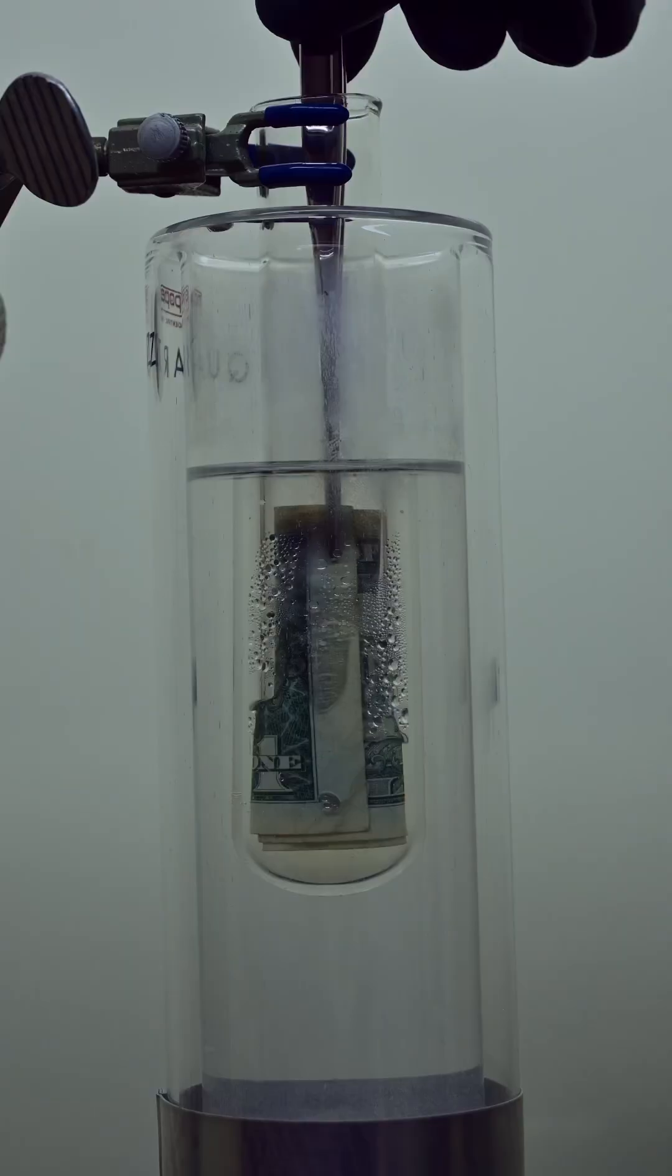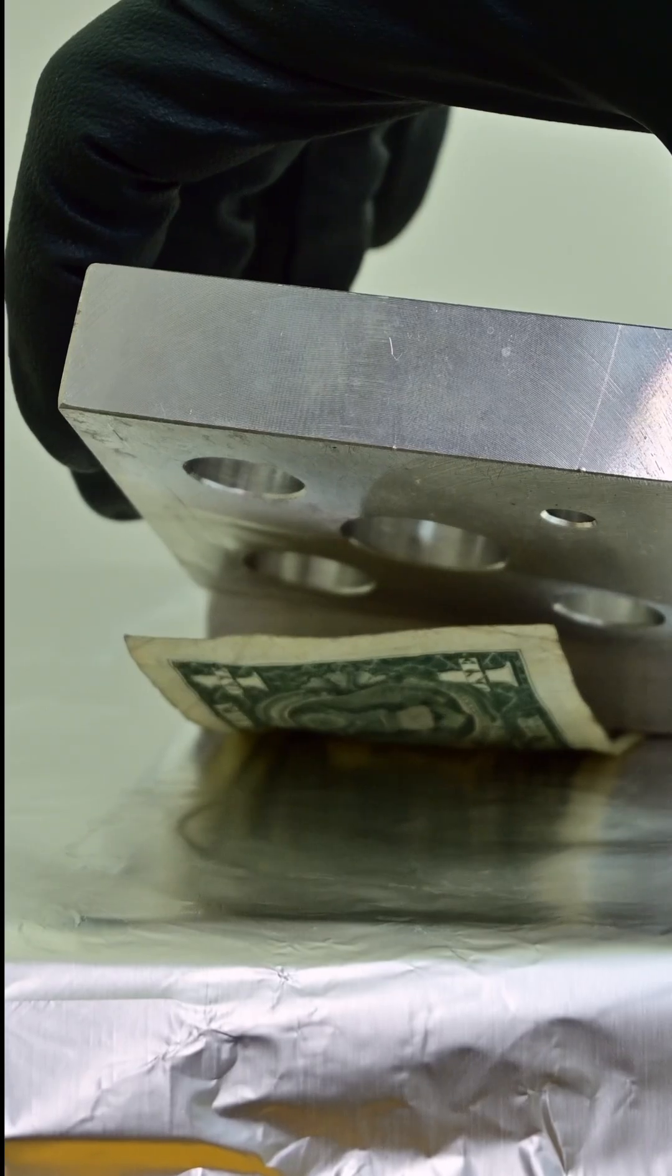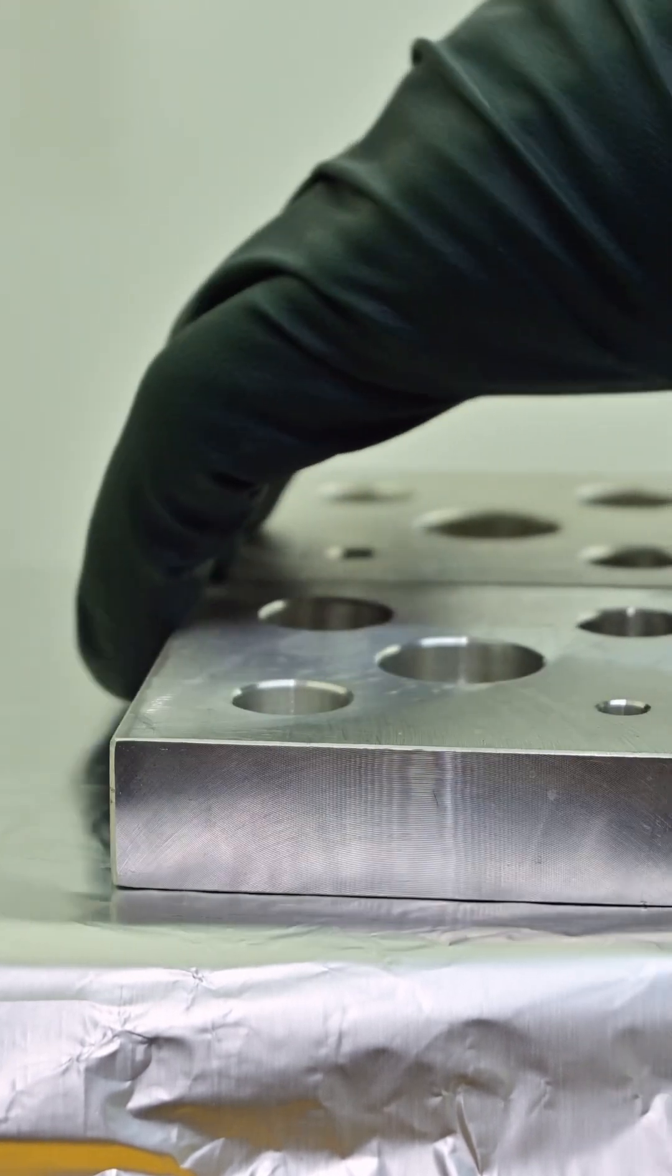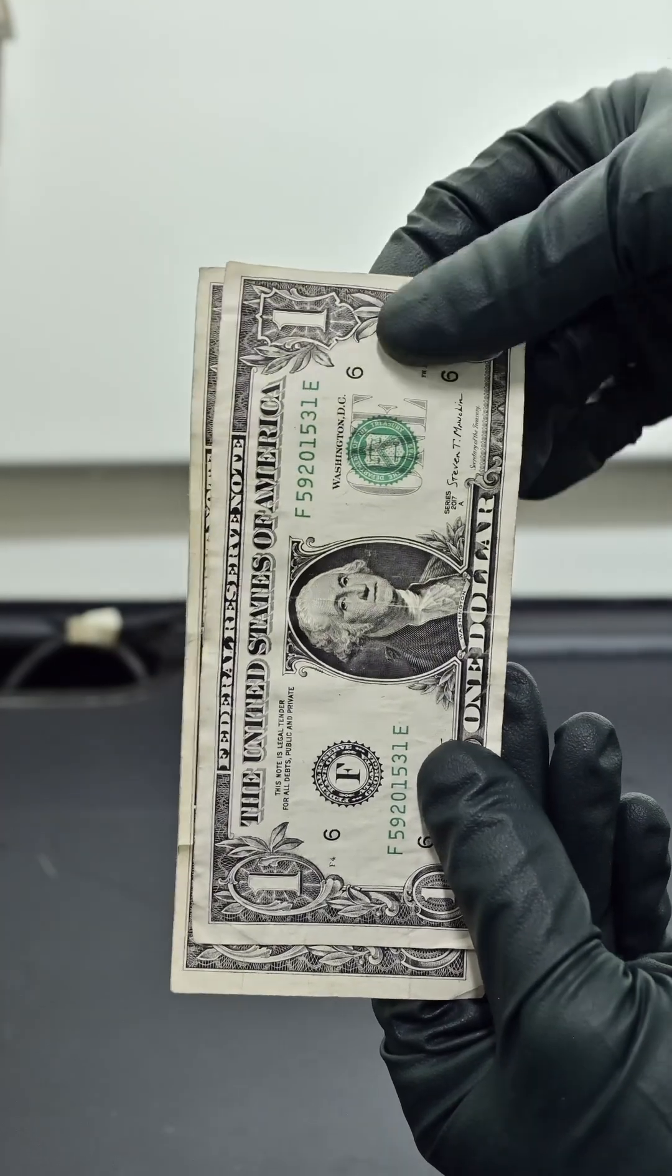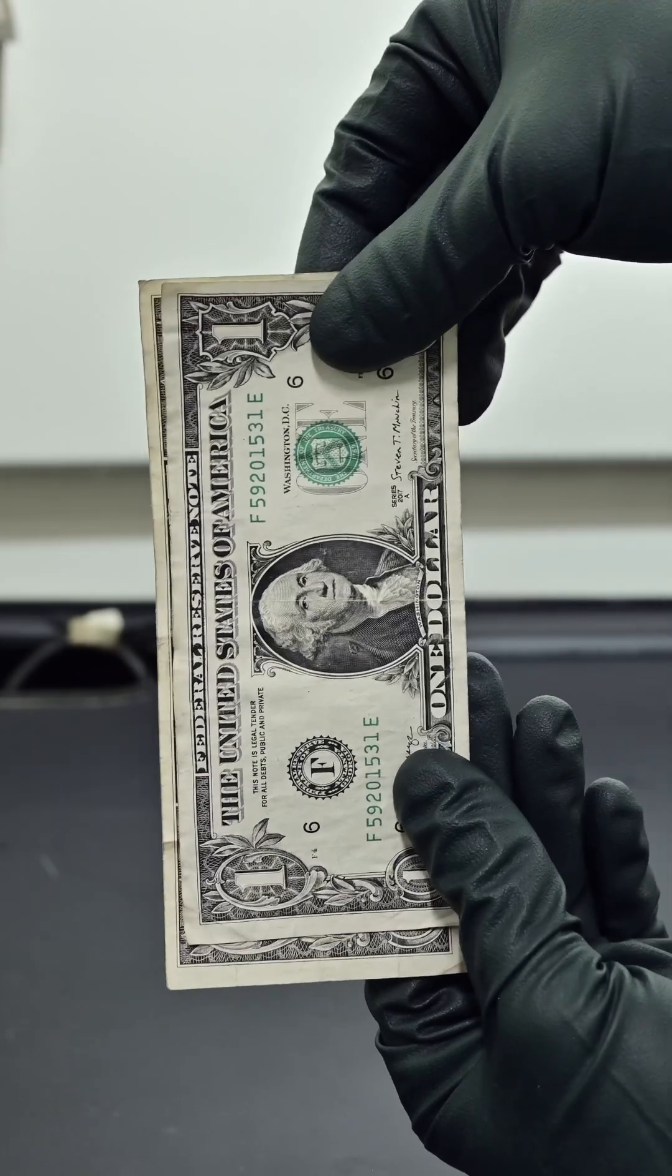But here's where it gets really interesting. Once I remove the bill and gently warm it up on a hot plate, the ammonia rapidly evaporates, causing those cellulose fibers to snap back in an even tighter arrangement, permanently shrinking the bill.